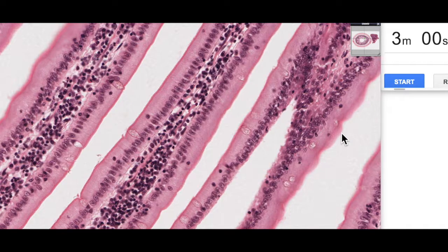Hello, welcome to another episode of 3 Minute Histology with Jamie Chapman. Today we're continuing our look at cellular staining with hematoxylin and eosin and interpreting what those stains mean.